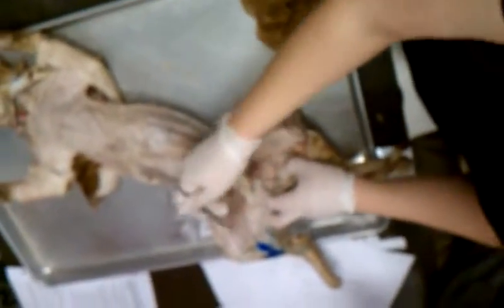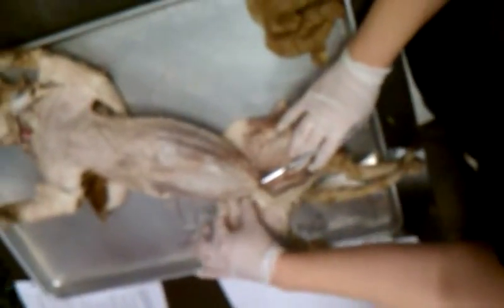But right now, we're going to look here on this leg first. So the difference between the right leg and the left leg here, you can see they definitely look different, right? What happens is here we've got the top layer of muscle intact, the more superficial layer of muscle, and you can see this top band right here, you can kind of separate them out with this line. Okay, I'm sorry, this is sartorius, the top one, and the gracilis is the lower one. And I always remember the gracilis is the lower one because it runs close to his groin, so gracilis, groin. Okay.